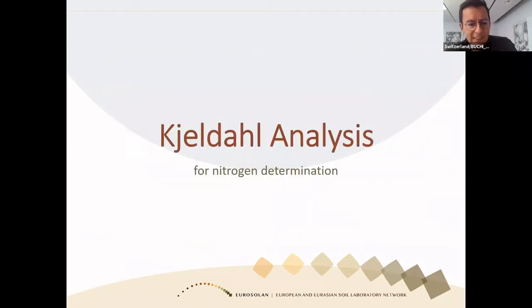So now I want to give the microphone to Estefania. She's going to talk about Kjeldahl for nitrogen determination. Hi, everyone. So Kjeldahl is one of the main techniques that we decided would be relevant to talk about. And we all know that nitrogen determination is quite relevant.